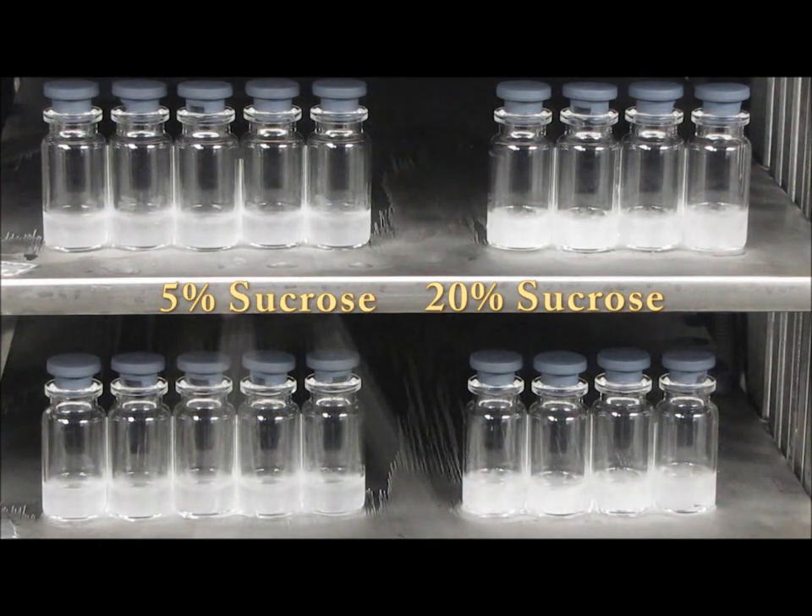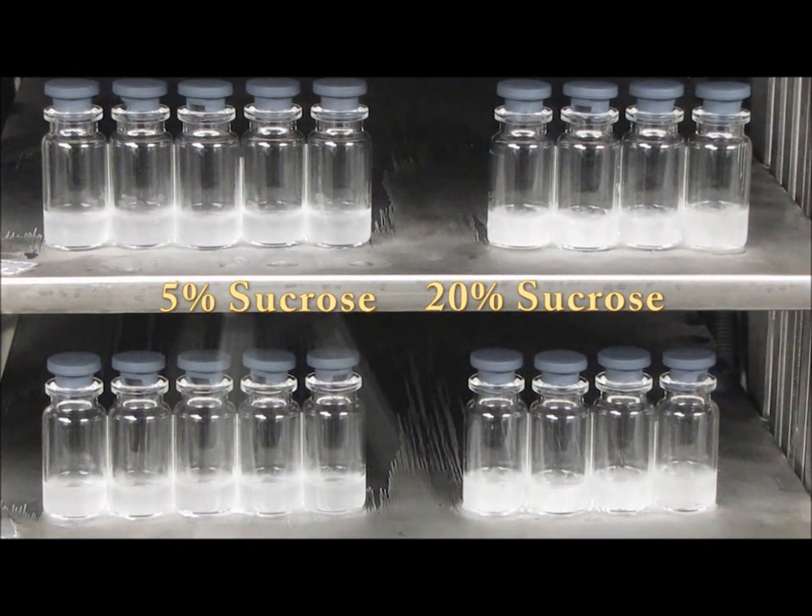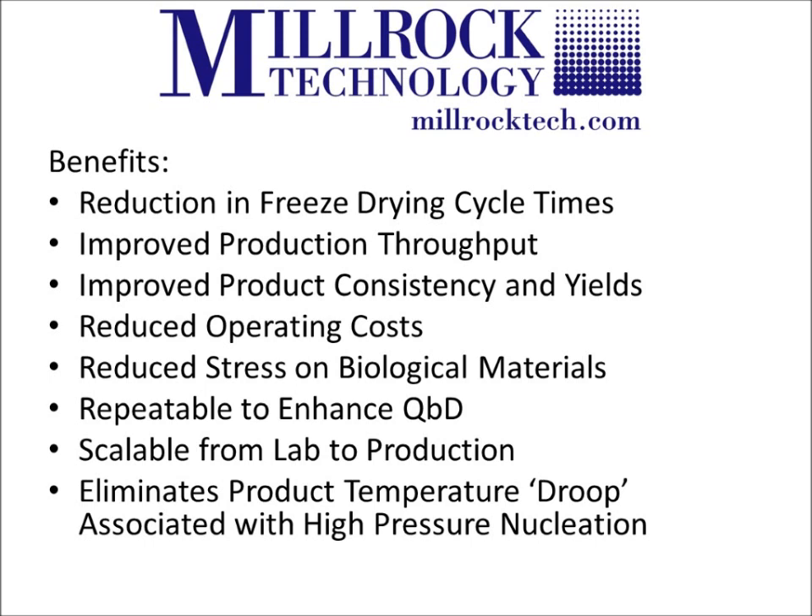The Freeze Booster system can be retrofitted to many freeze dryers by using Millrock's Control System and Field Installable System Modifications. Benefits include reduction in freeze drying cycle times, improved production throughput, improved product consistency and yields, reduced operating costs, reduced stress on biological materials, repeatable to enhance QbD, scalable from lab to production, and eliminates product temperature droop associated with high pressure nucleation.